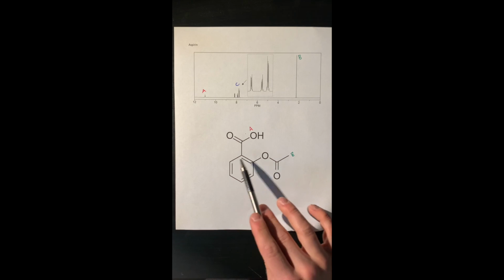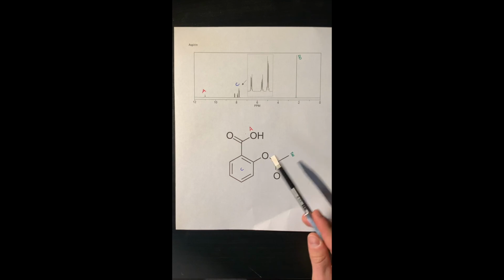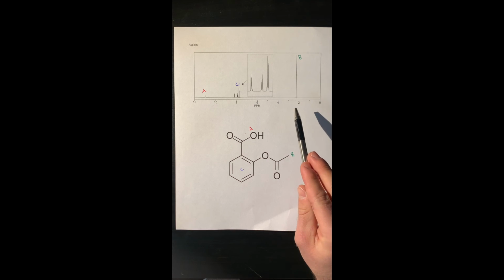So in the grand scheme of things, aspirin is not a complex molecule, and noticing this small peak that indicates a carboxylic acid basically covers 1 out of 3 of the major parts of this molecule. And so as you can see here, the other groups are this aromatic here labeled C, and then the ester right here that's labeled B. So now we're going to talk about the furthest upfield and the tallest peak on this spectrum, which is the singlet at about 2.2 ppm.